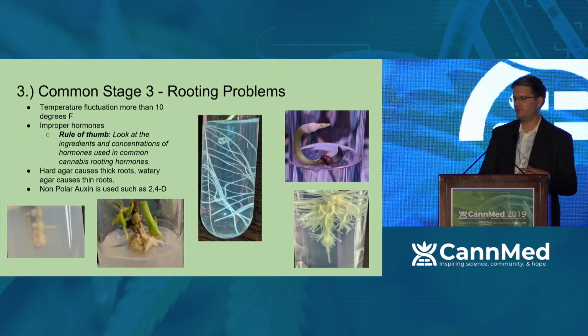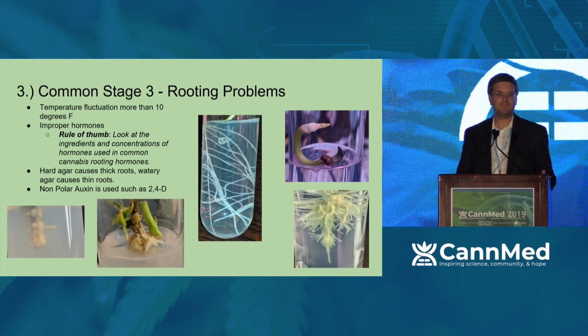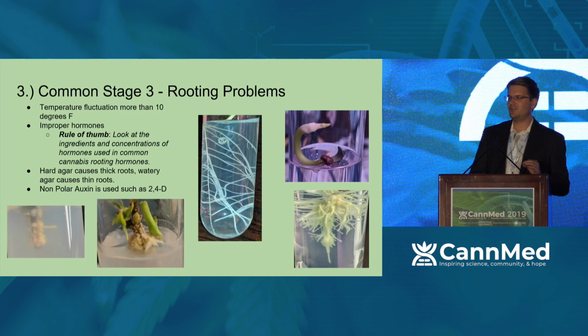I do also need to mention the previous media plays a big impact or has a big role in your actual next successive stage. If you have too much cytokinin buildup from stage two or multiplication media, your stage three media will have residual and you're going to form more callus than you will roots. Ask me why, I don't really know, but that was just something that I saw, along with nonpolar auxins.